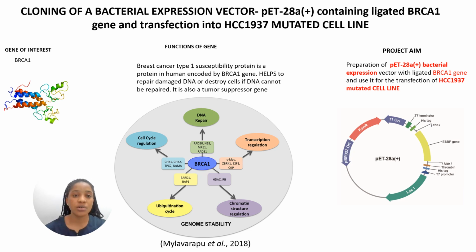Today, I'll be talking about how I'll be cloning a bacterial expression vector containing my desired gene of interest and how I'll be transfecting a mutated cell line using this expression vector.